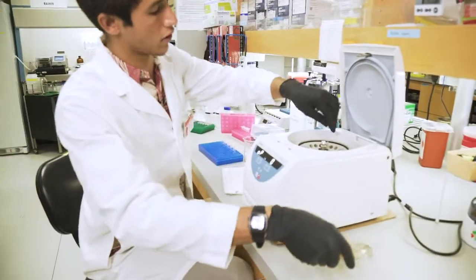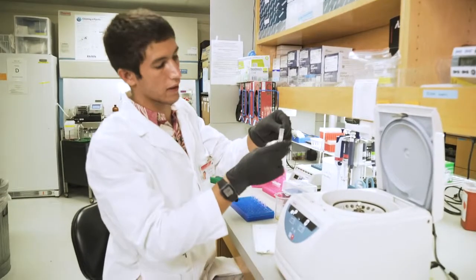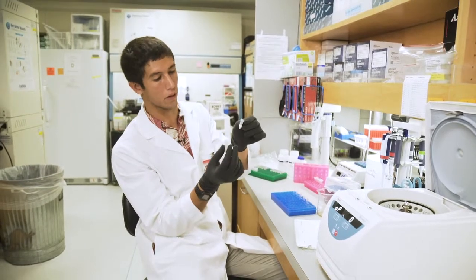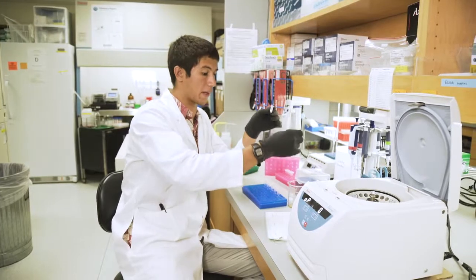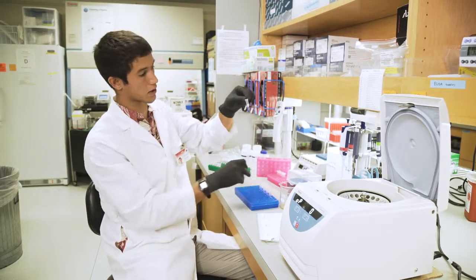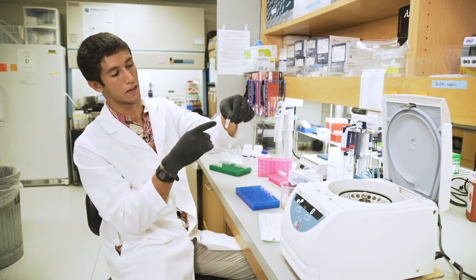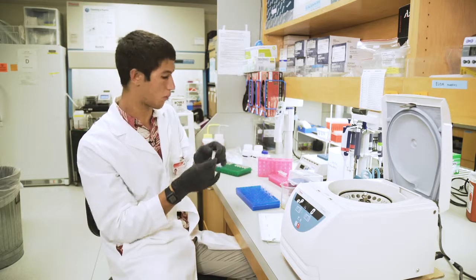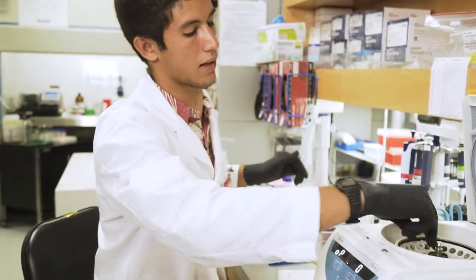We're done with these collection tubes. The flow through is mostly clear, and our old collection tubes are contaminated with all the liquid that was in them. Even though you could dry this out, it'd still be there. So the whole thing gets to go into the waste container. And this guy, which you can't see, but there should be precipitated DNA still on the top of the filter. So he's going to go into a brand new collection tube that came fresh out of the bag, is clean and sterile and doesn't have anything in it.